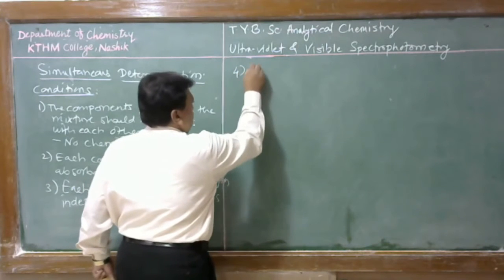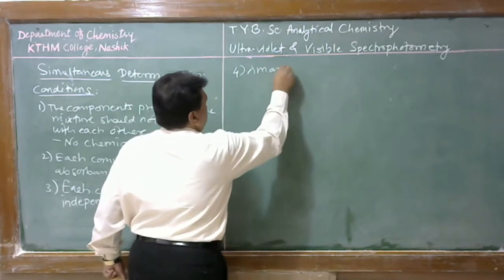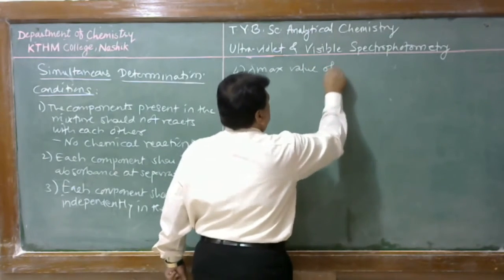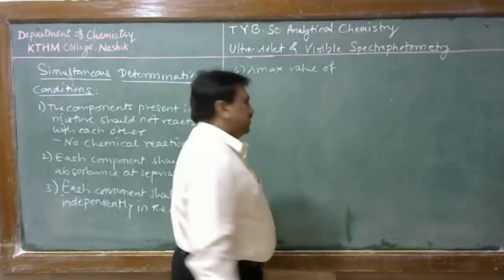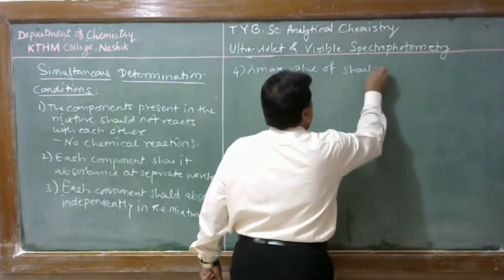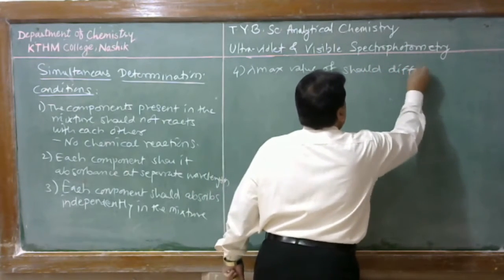Fourth, the lambda max value or wavelength of absorption should differ widely. Lambda max value should differ widely.